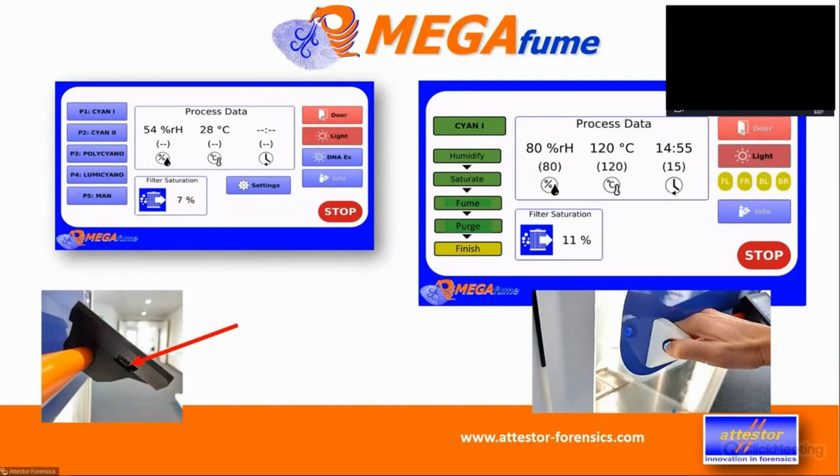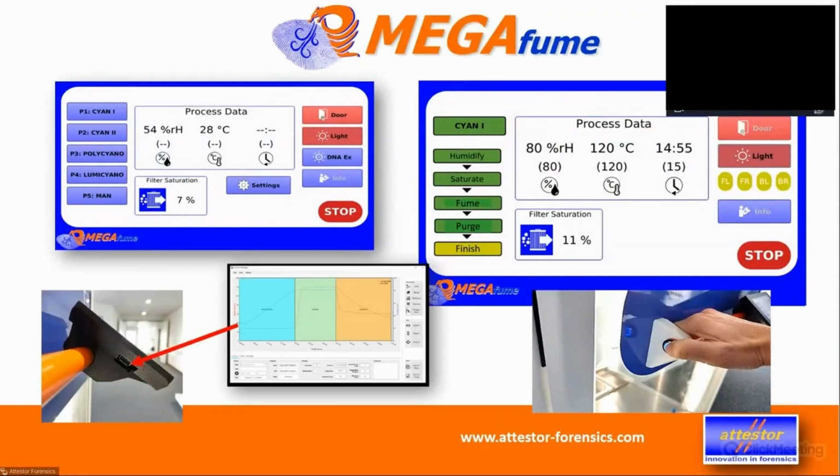So you extract that from your cabinet, and there's a small PC program called Data Analyzer where you can graphically display the results. Looks a bit like this one. The software does then automatically recognize which of the steps that was. Was that the humidification step or cycle? Was that the fuming cycle or the purge cycle?